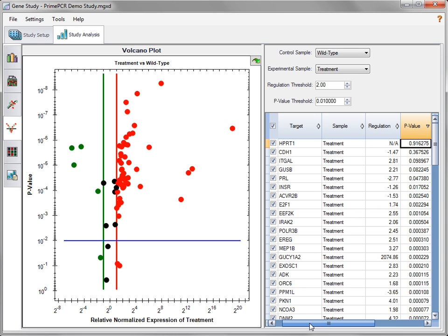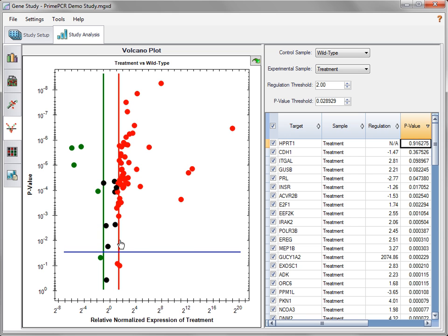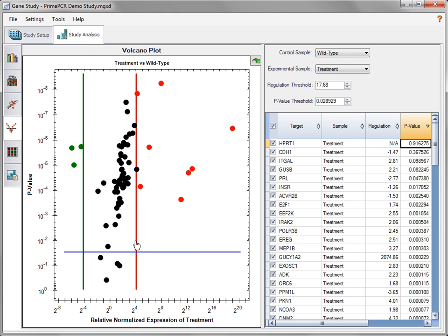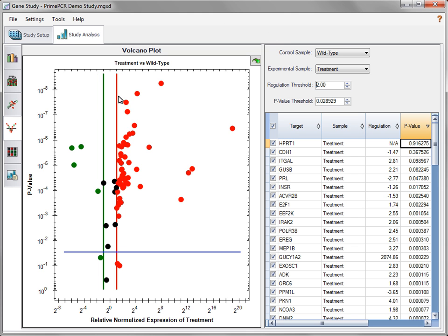Note that triplicates are recommended to determine proper significance. In the spreadsheet, the values in any column can be sorted by clicking the arrow adjacent to that column's heading. The p-value threshold can be adjusted by entering a value in the window or clicking and dragging the threshold line. The regulation threshold can be changed in a similar manner. Data points that are above the p-value threshold line and are either red or green are regulated above the threshold level and are statistically significant. These targets are promising candidates for further investigation.